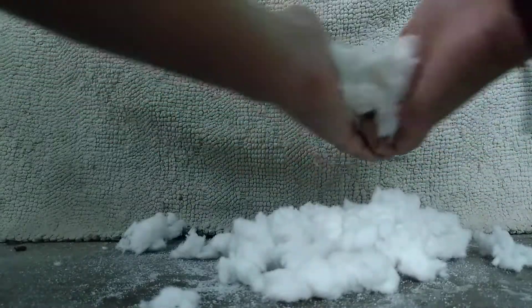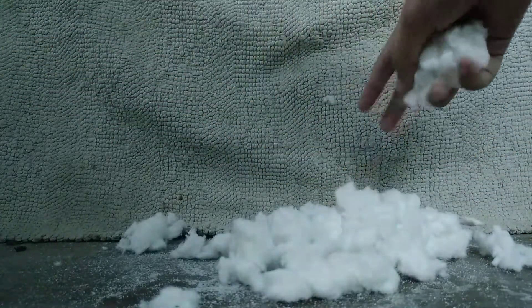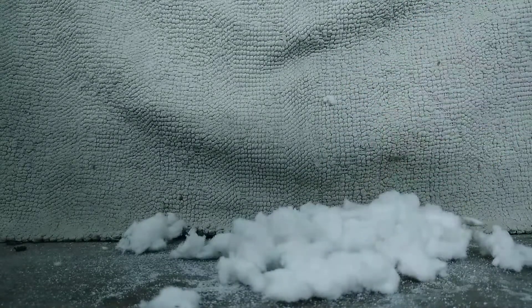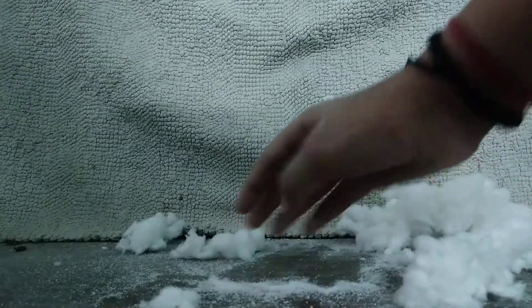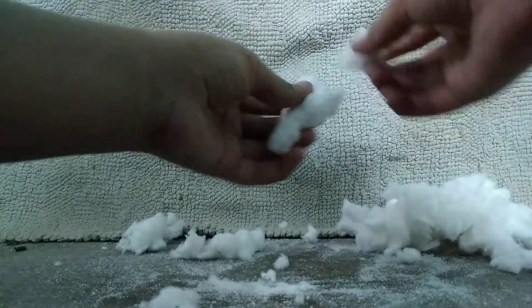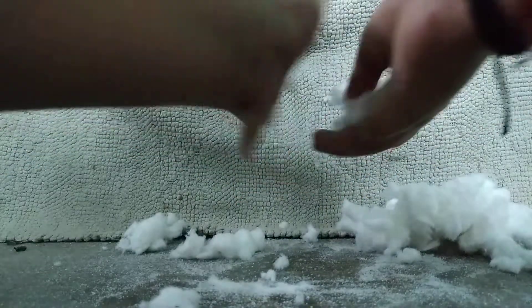I think that all this white fluffy stuff is actually just cotton. And all this powder which is here, I think this is the real sodium polyacrylate that we are after.